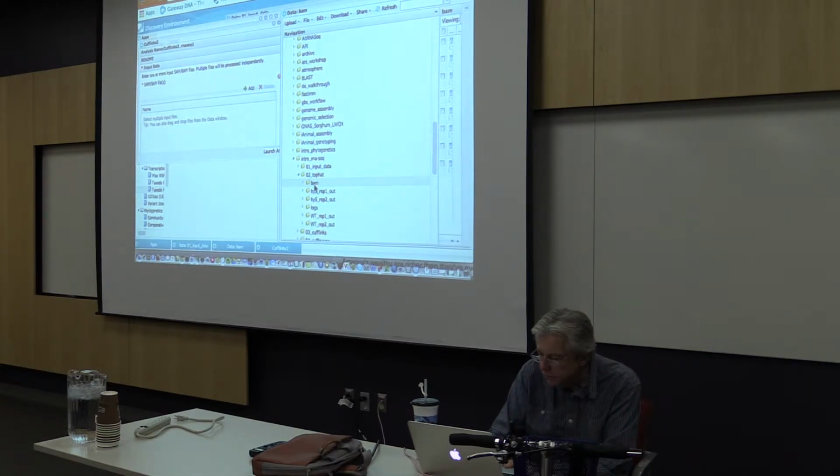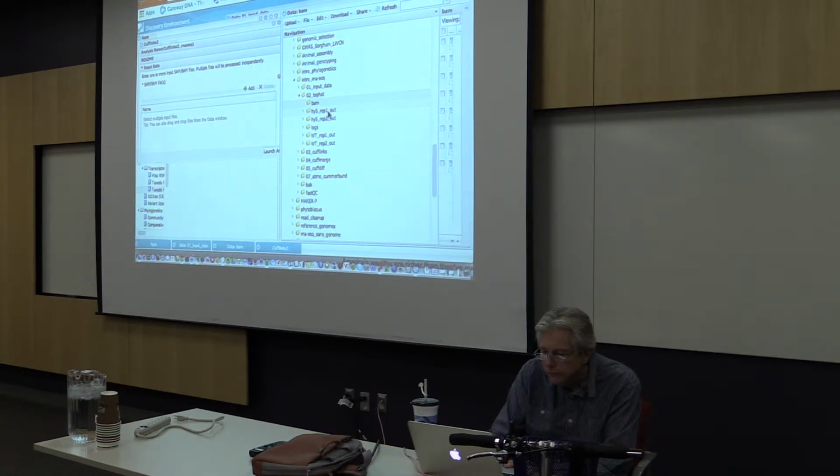Well, the information is in here. Oh, okay. And so these are directories. Sorry. Oh, I'm sorry. I keep forgetting. The useful stuff is in the BAM directory, or it's supposed to be.